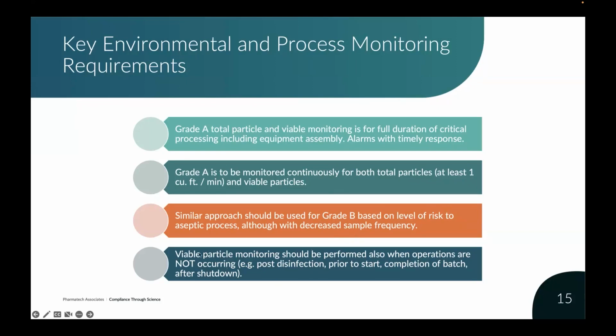It is notable that viable particulate monitoring should be performed also when operations are not occurring, right? So we don't need to just have our viable particle monitoring within the operation, but also post disinfection, prior to the start, and so we talked about equipment assembly, completion of the batch, and after any shutdown of the clean room.